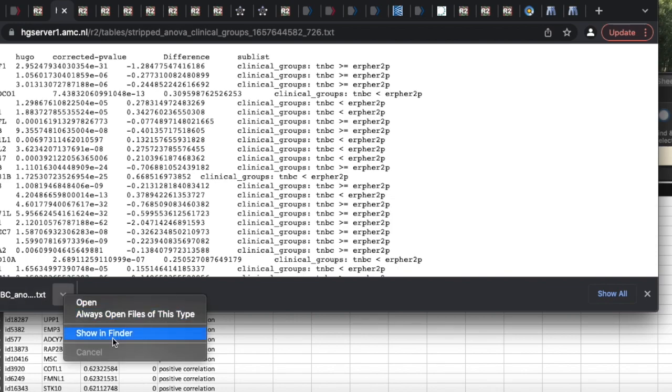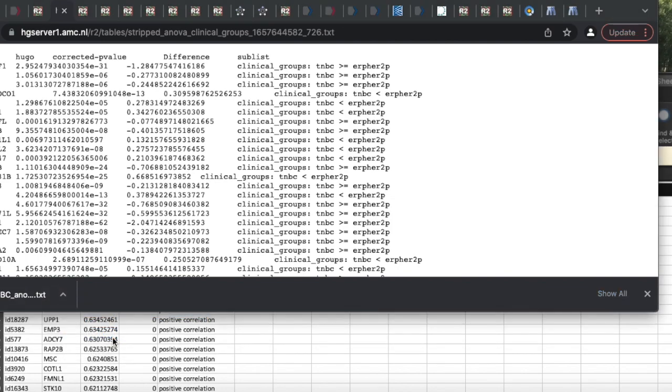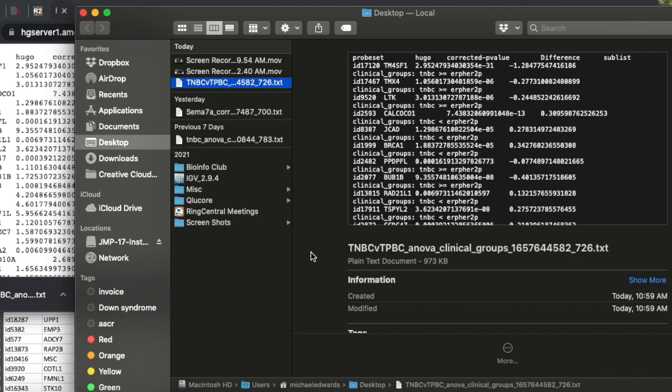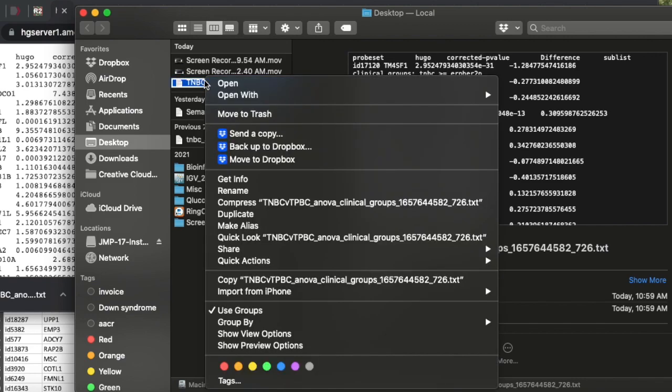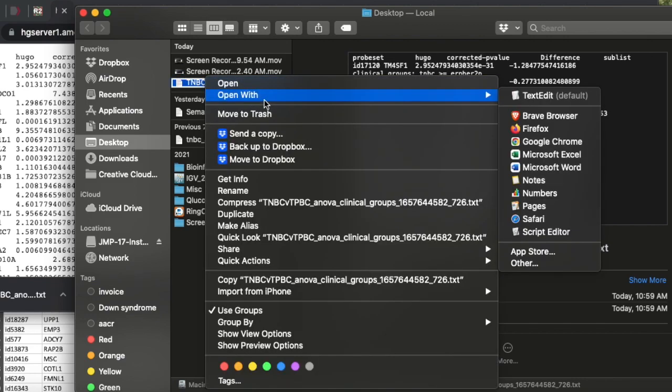So here, once we've saved it, what I want you to do is go where you saved it. I'm going to show mine in finder, just find it somewhere. Here's what I want you to do: when you find it, highlight it, right click and say open with.